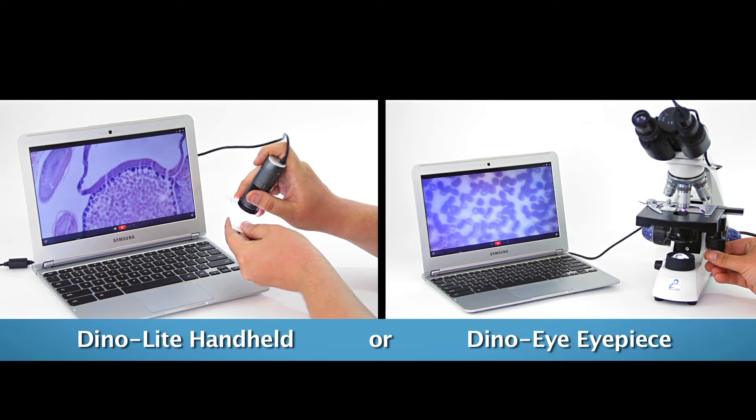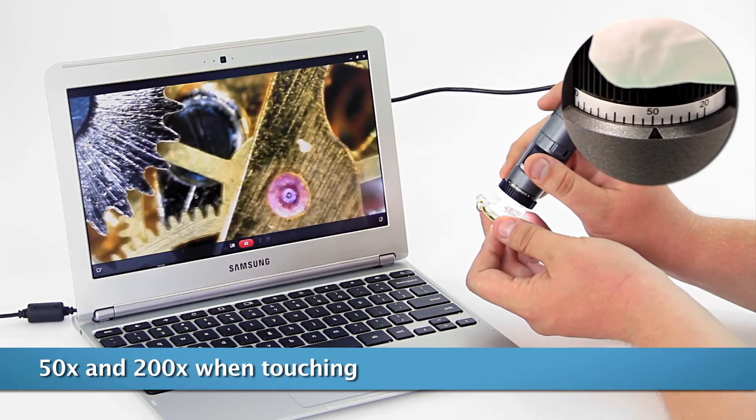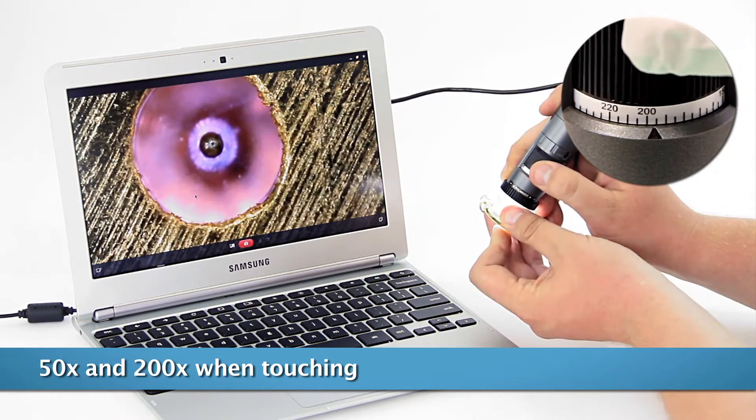When viewing with a standard model, touching an object focuses in at 50 times magnification and also again at 200 times.